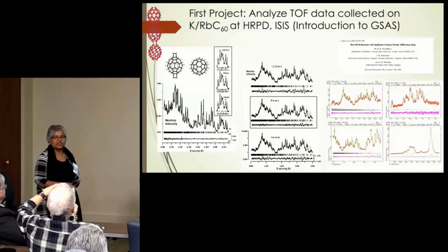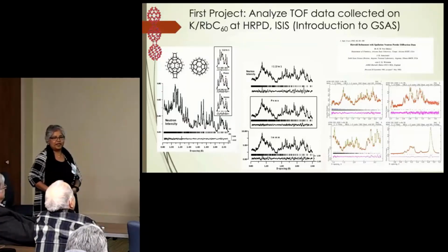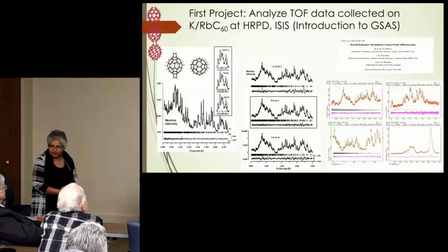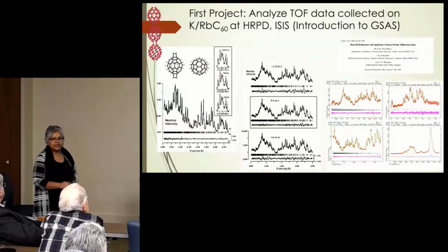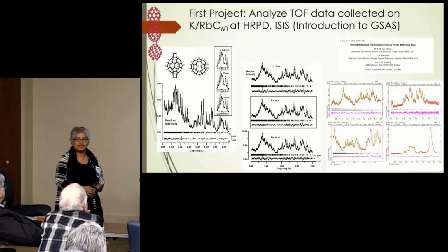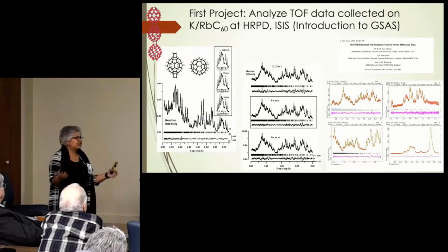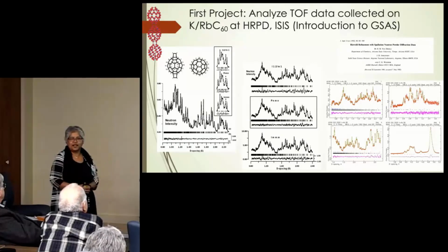I had just joined Peter Stevens's lab. And the first Rietveld program that I learned how to use was not GSAS. It was actually FullProf. But then he handed me a bunch of neutron data and said, me and my previous student collected this data at ISIS, but we never really finished the refinement. Maybe you want to have a try at it.